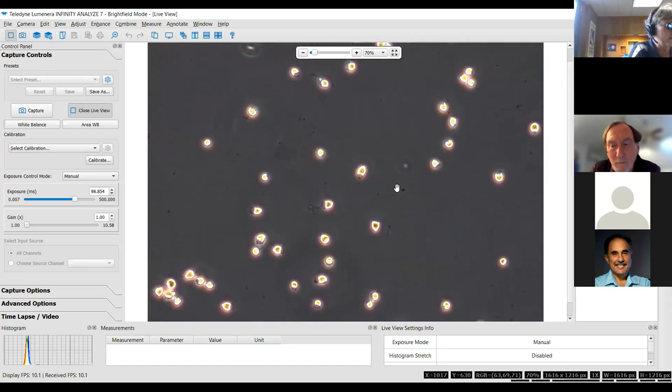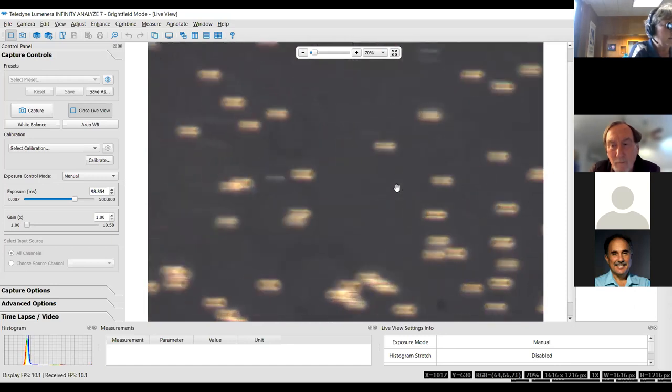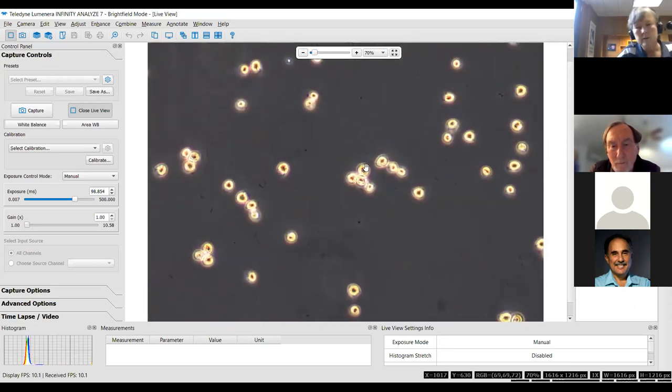They're cool to watch, they're fun to watch. And here's one where you can see there's one little flagella right there. If you look at enough cells, and you're looking for 50 to 100 of these, if you find 50 to 100 of them and you find the features you need, yay you. Otherwise, I'm really familiar with Uroglenopsis, so I'm going to call this Uroglenopsis. There's only a couple species really, and americana is the most common one.